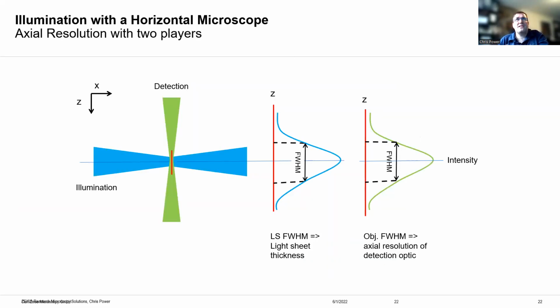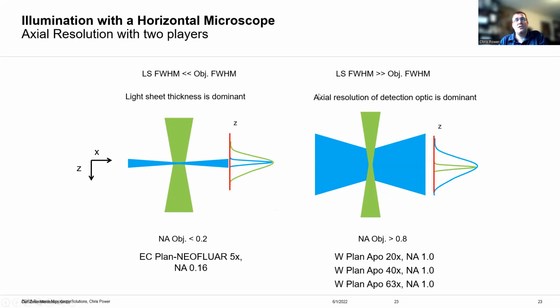So that's the main advantage, its sensitivity. But the other advantage, I alluded to with the theta microscopy, is that because in light sheet your PSF is determined by your excitation and your detection, then depending on the lens you choose, you tend to always get reasonable sectioning. Because if your detection lens is poor, your light sheet can be relatively thin, you get good sectioning. And if your lens is very good, then that can also bring down sectioning even with a thick sheet.